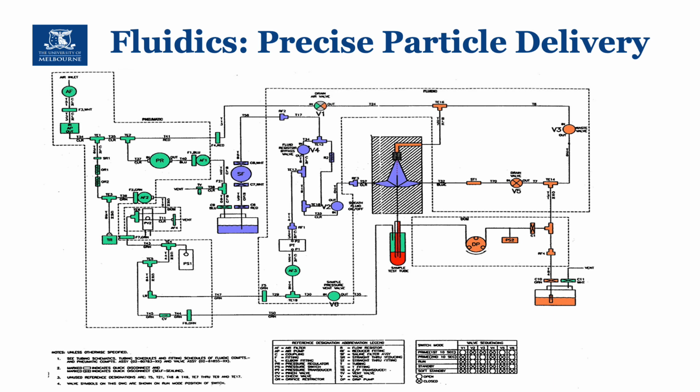We used to have one of those, but it's no longer operational. But you can see how many elements in terms of electronic design and components are involved in guaranteeing that the measurements are consistent, the velocity is constant, and the laminar flow is preserved, etc. Yeah, so it's a very complex system.